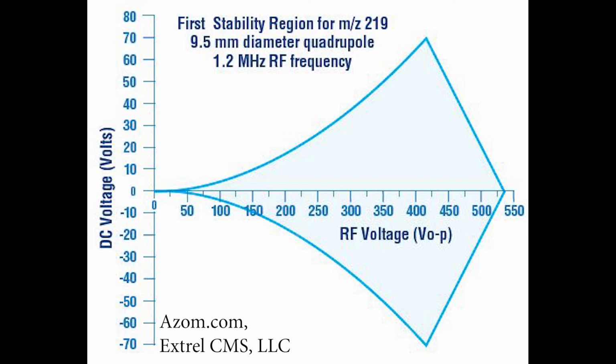We are not going to change the frequency during this experiment. It's difficult to make a good stable RF frequency, so for all these instruments, the frequency is going to be pretty much around a megahertz.